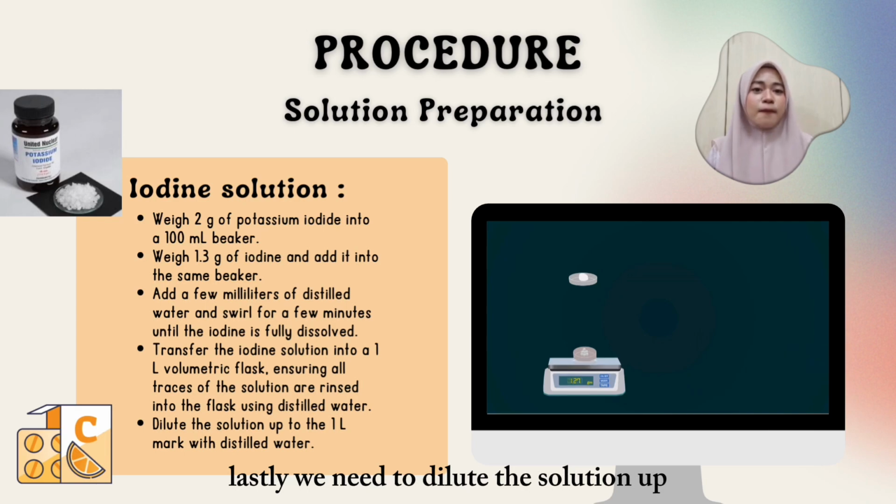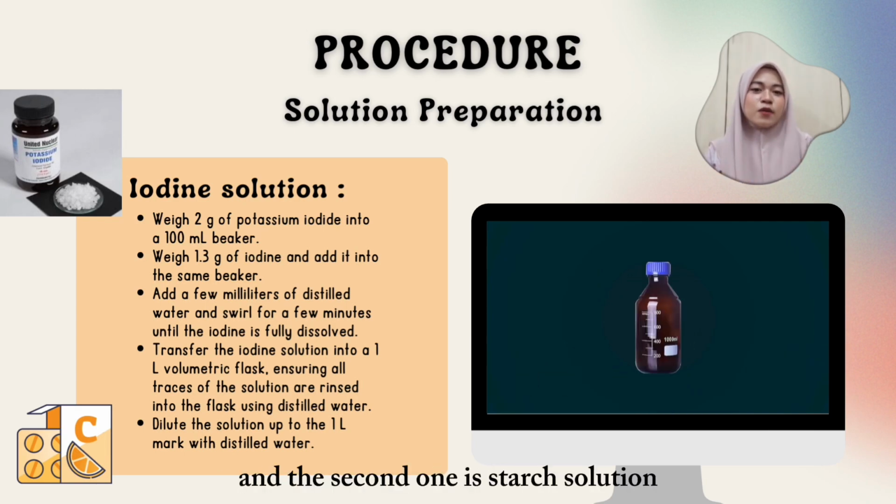Lastly, we need to dilute the solution up to the 1 liter mark with distilled water. And the second one is starch solution.